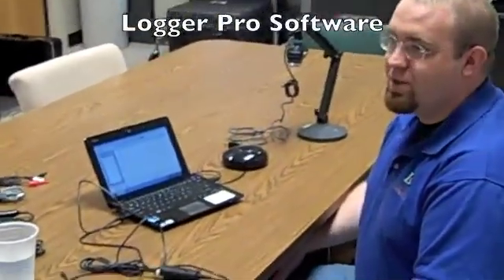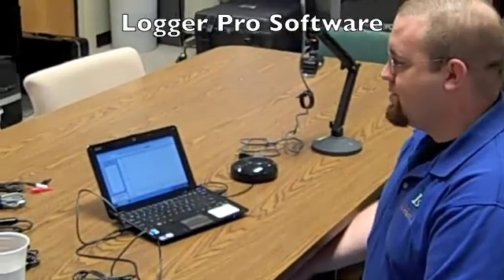So here we have Logger Pro software, which is scripted to work with JAWS.